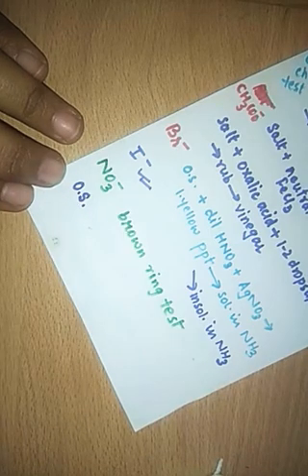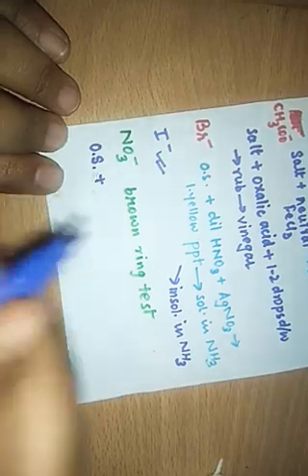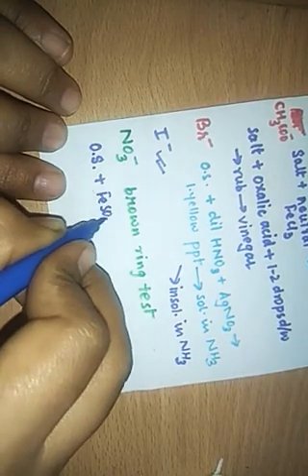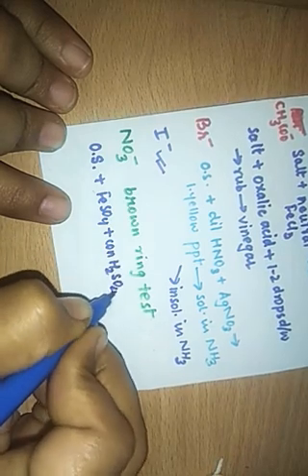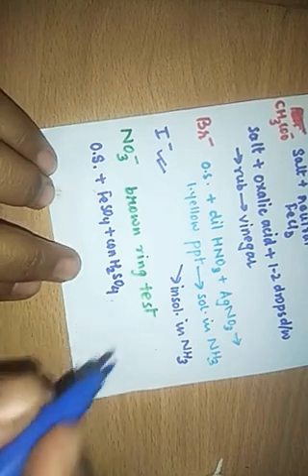Obviously the original solution is prepared in distilled water, then we add freshly prepared FeSO4, ferrous sulfate, otherwise the ferrous will get hydrolyzed. So we'll take freshly prepared ferrous sulfate solution, and then we will add concentrated sulfuric acid dropwise along the sides of the test tube.